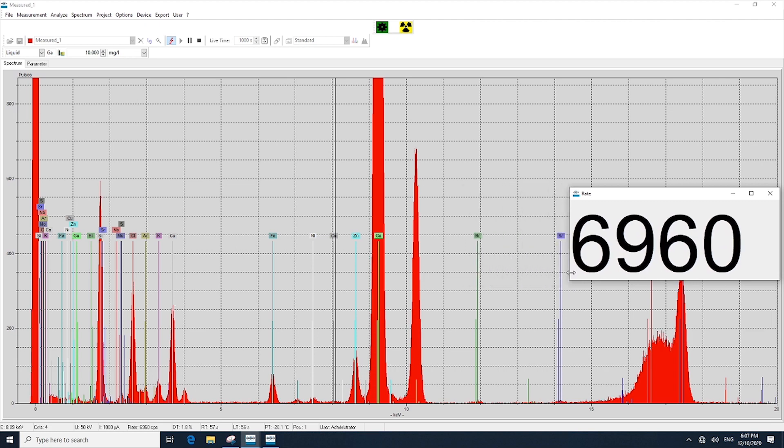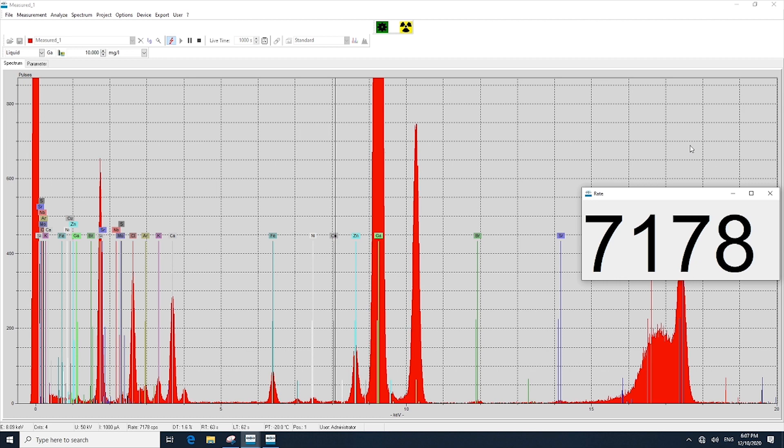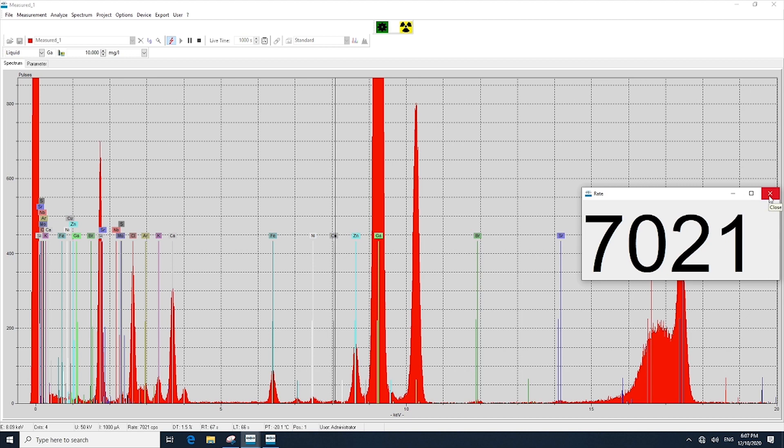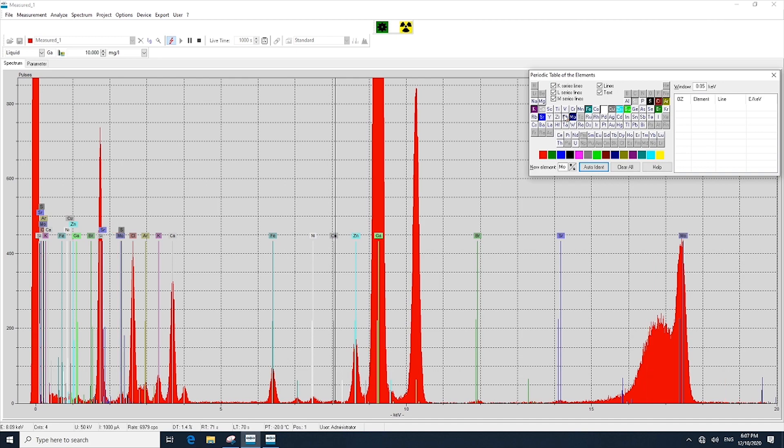Here we see, as the sample is analyzing, our count rate — this is how many counts are coming to the detector, and we're roughly at about 7,000 counts with this particular sample. We can see that this sample is actually very clean, with very low amounts of various heavy metals present.